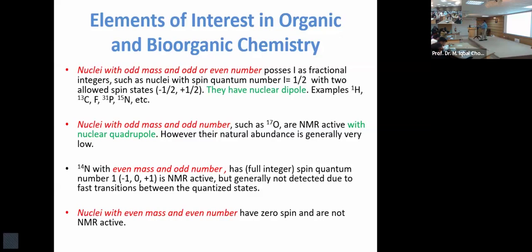Less than 1 joule. It's just a very, very small energy which you need to discover. Where you have two energy states, dipolar nuclei, you have population here and here. The difference between populations is something which you can measure.